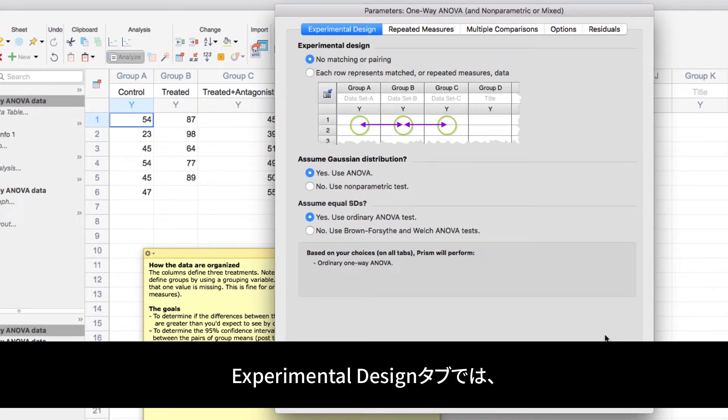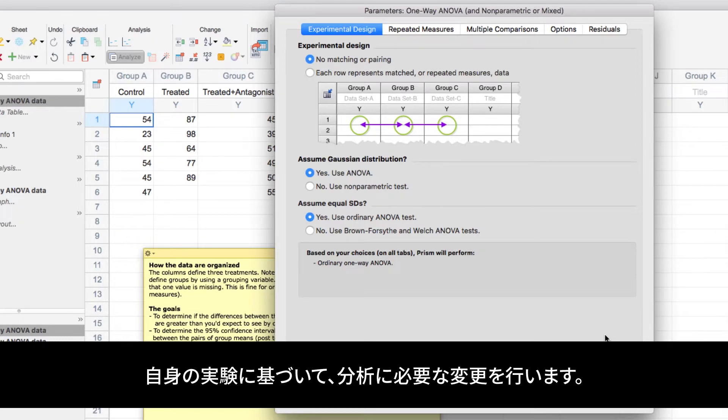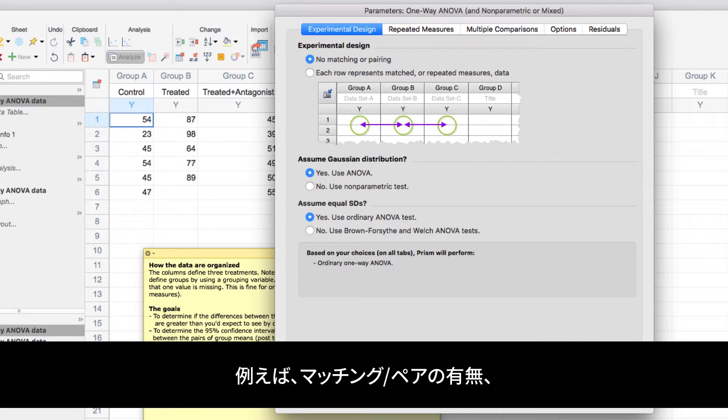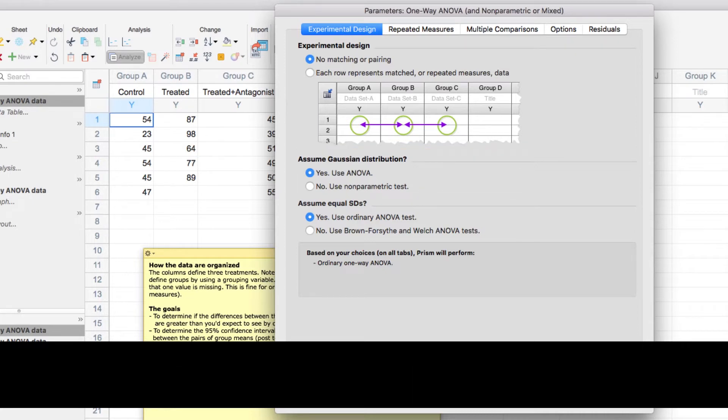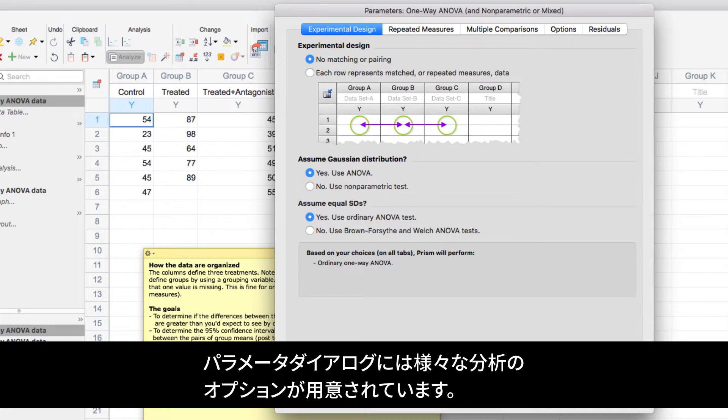In the dialog that appears under the very first tab of Experimental Design, you'll be able to make any necessary changes to the analysis based on your own experiment. For example, whether your data were matched or paired, or whether you can assume that your data were sampled from a Gaussian distribution.